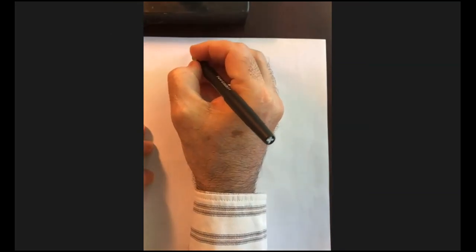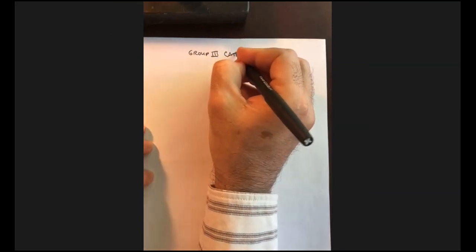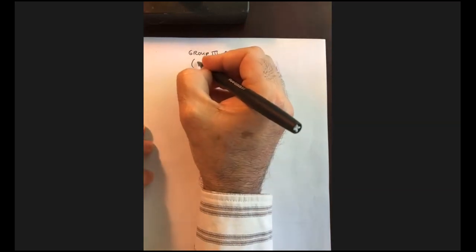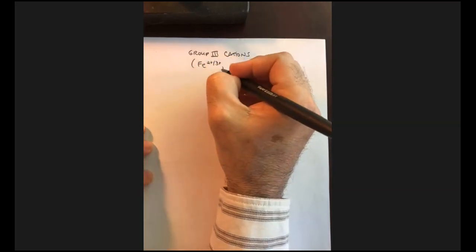Okay, let's start out by talking about this group 3 ions. And we're going to specifically focus on iron, which will come in both its +2 and +3 oxidation states. We're going to talk about nickel, and then we're going to talk about chromium 3 specifically, all right?